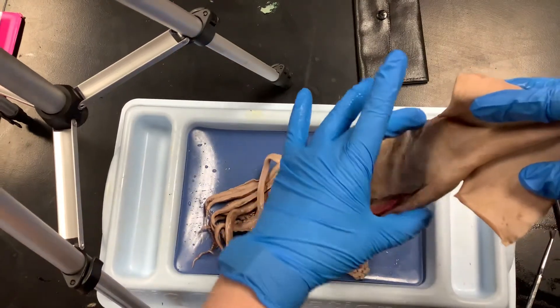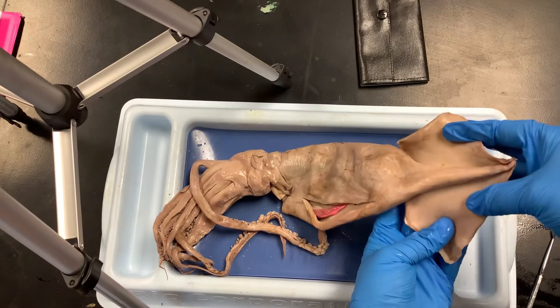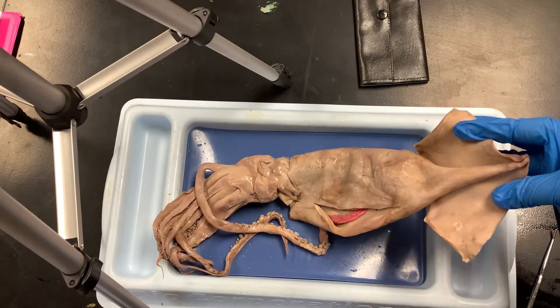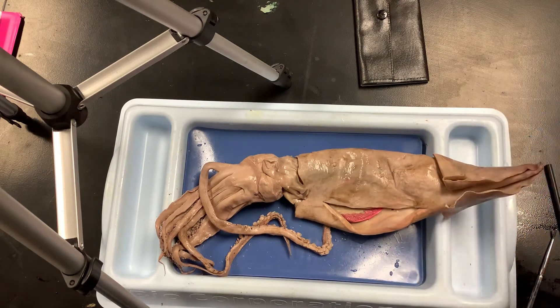This whole structure up here is the mantle. The mantle has two lateral fins at the end, which are mostly for allowing the squid to change direction quickly.